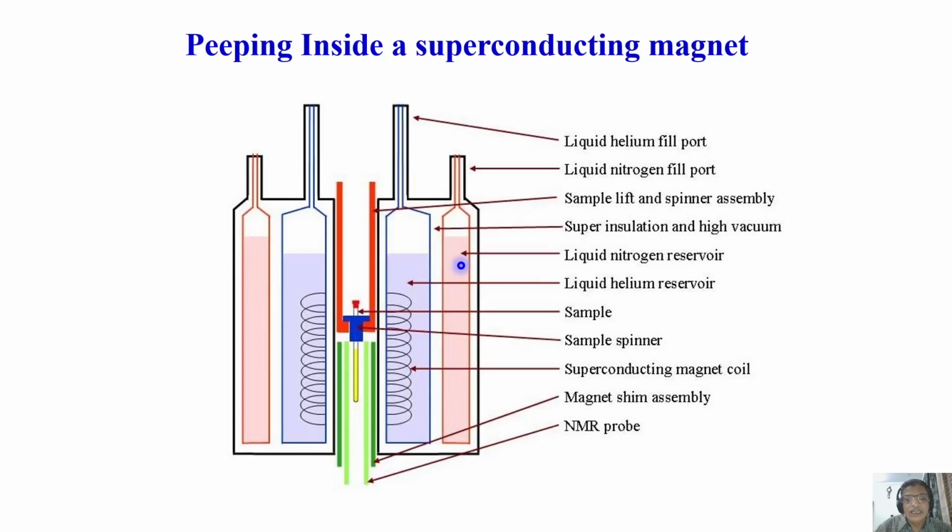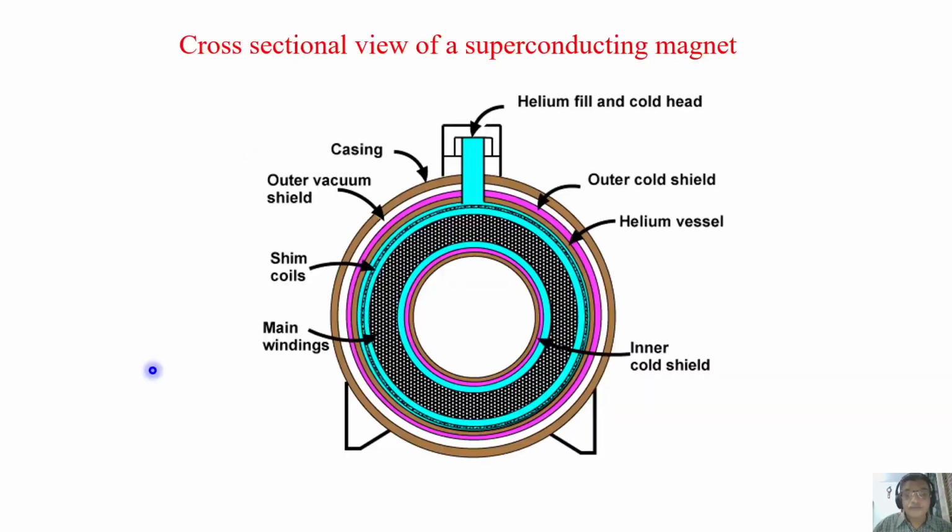So very simple. Basically, it is the highest quality, most sophisticated version of a thermos flask. That's all. I mean, I cannot make such a cheap statement. It is not that. This is a superconducting magnet. Technology is highly different. Okay. But the concept you can imagine like a thermos flask.